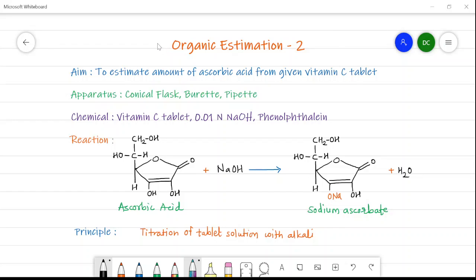Hello friends, welcome once again in the second estimation. In this video we will see the estimation of vitamin C. The aim of this estimation is to estimate the amount of ascorbic acid from the given vitamin C tablet. We know that vitamin C is nothing but ascorbic acid, and it is useful for human beings because it is an antioxidant.